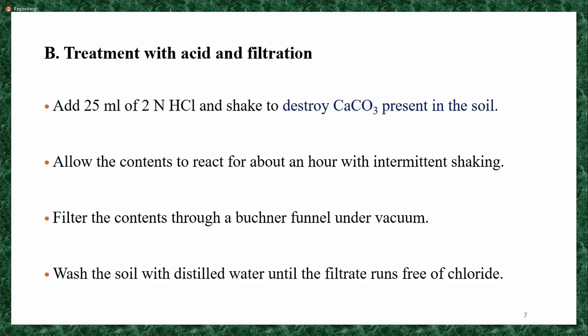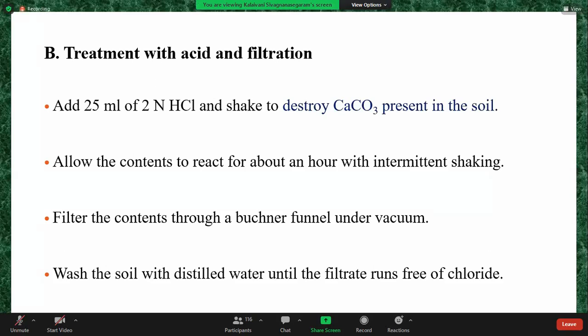If we ask what is the purpose of adding HCl, you have to say, okay, so to remove the calcium carbonate. So did you understand this one? Yes, ma'am. So then let's move into the next step.